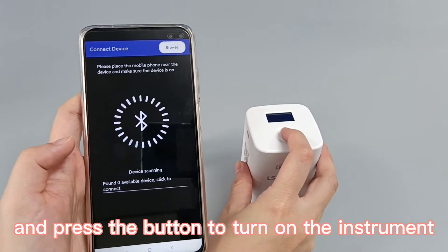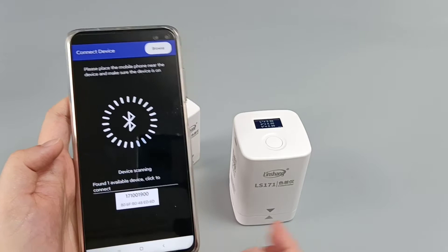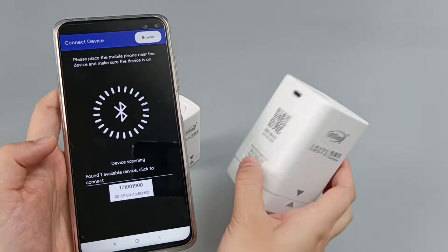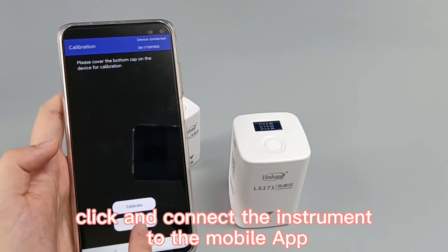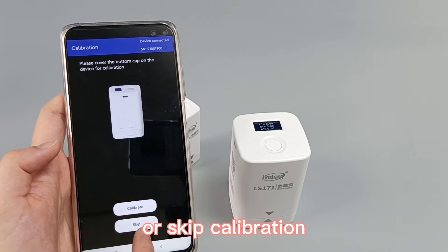Press the button to turn on the instrument. We can see the SN number is the same — click to connect the instrument to the mobile app. We can then choose to calibrate the instrument or skip calibration.